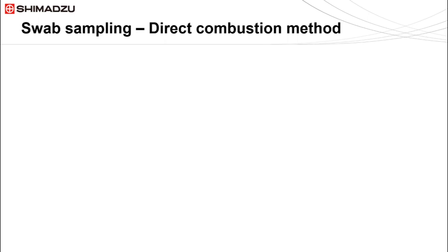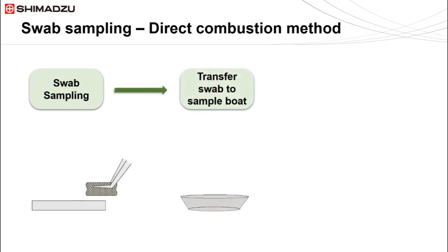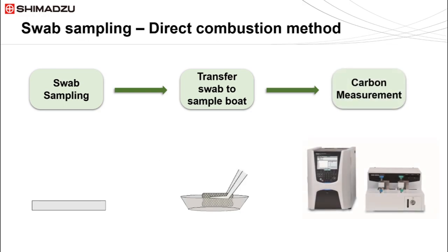For swab sampling with direct combustion method, there are three main steps. There is swab sampling, transferring of swab to sample boat, and carbon measurement.